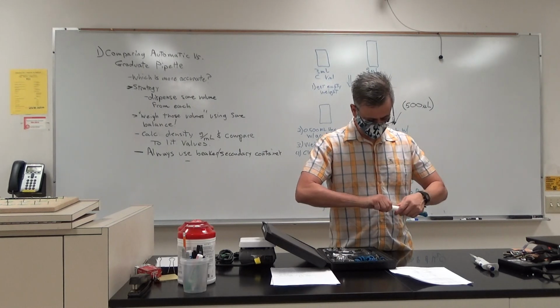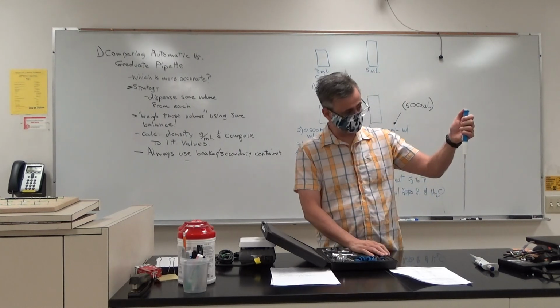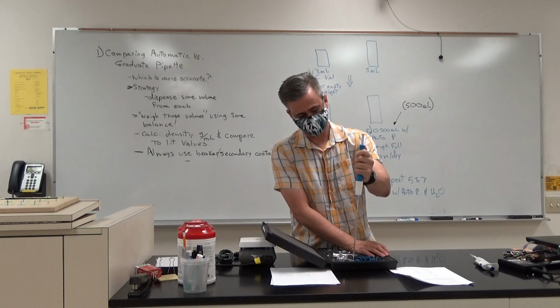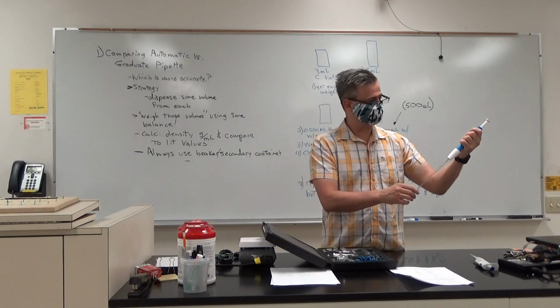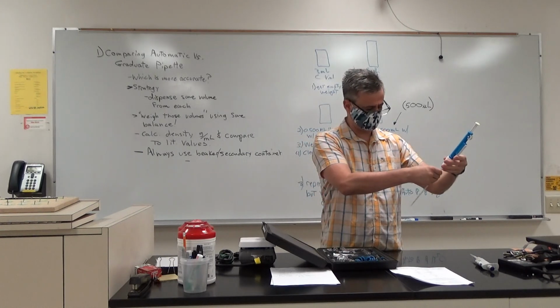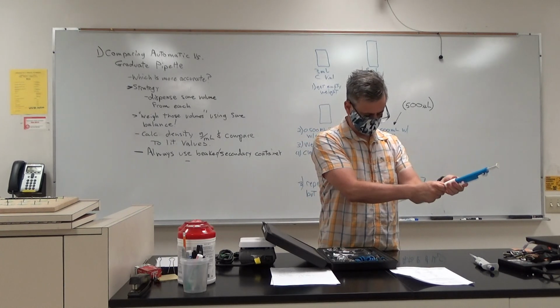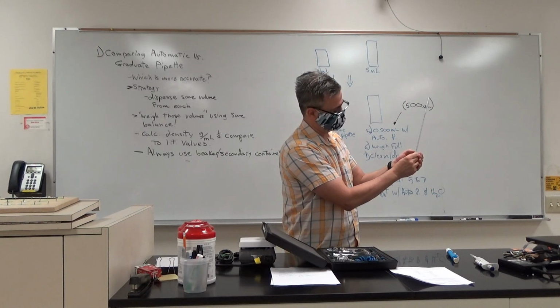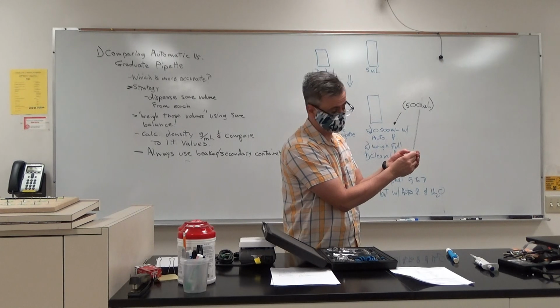So we put that in there, and then we stick this down in, and then we start rolling it up. Get yourself somewhat familiar with how this is designated. It actually goes in reverse.